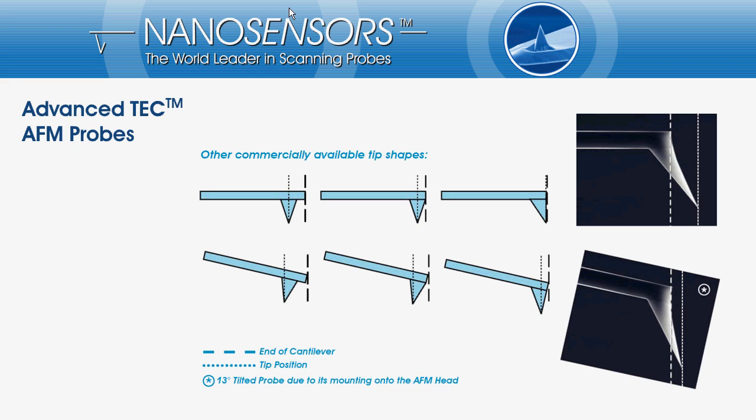If you would take a look from the top you can virtually see only the tip of the tetrahedral tip at the cantilever end. For the two other types the tip cannot be seen at all. But if the tip is mounted in the AFM it will be tilted.